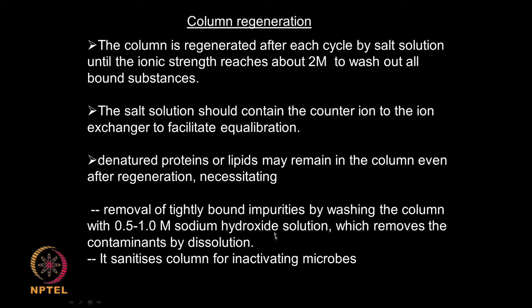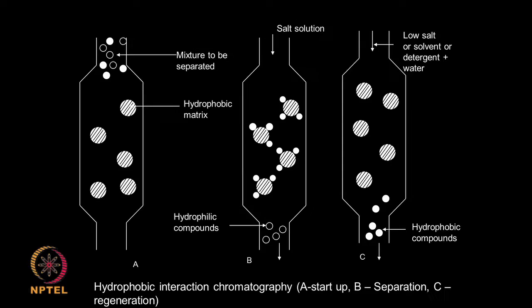And sometimes if there are microbes present, we need to sanitize. Of course, the sodium hydroxide also helps in the sanitization. Next one is hydrophobic interaction chromatography. We looked at ion exchange. So, in this hydrophobic interaction, we are separating proteins based on their hydrophobic nature of the surface.